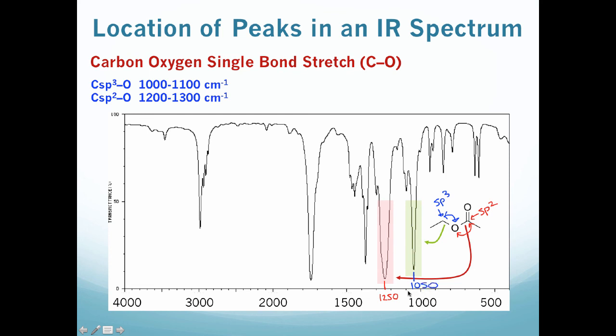So very diagnostic for esters. And just to look at something we already talked about, of course an ester has this carbonyl. Here's our carbonyl stretch.